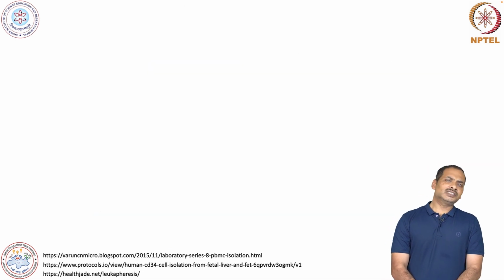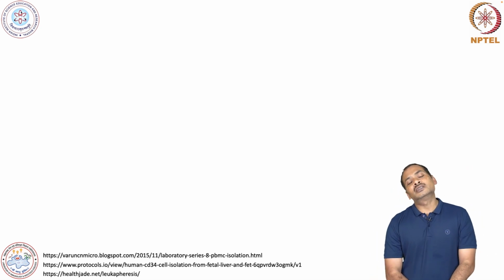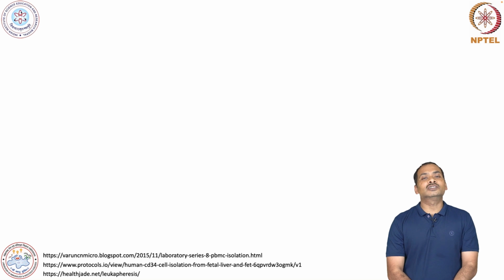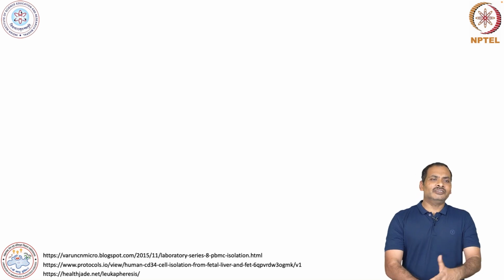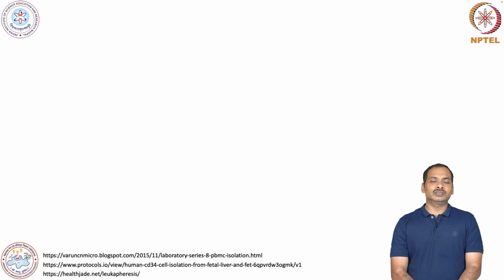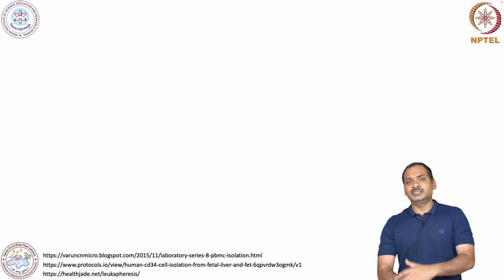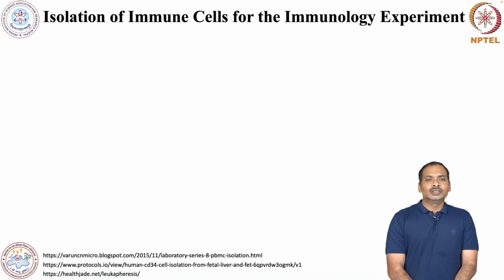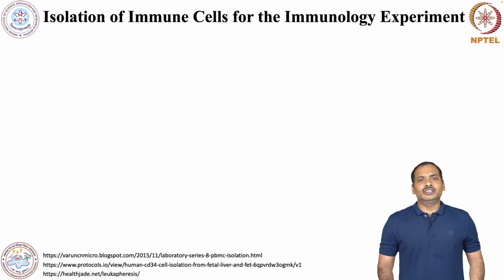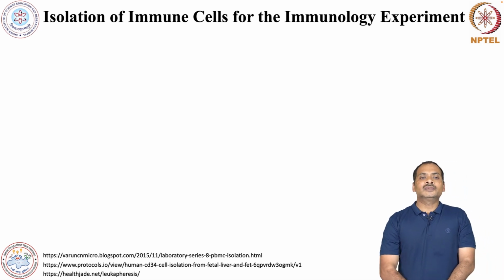Now the next question is how we can isolate these cells in order to perform any experiments, okay. So here I will just give you a glimpse of how we can isolate these cells from the blood, okay, for performing various kinds of experiments, or even for diagnostics, okay.